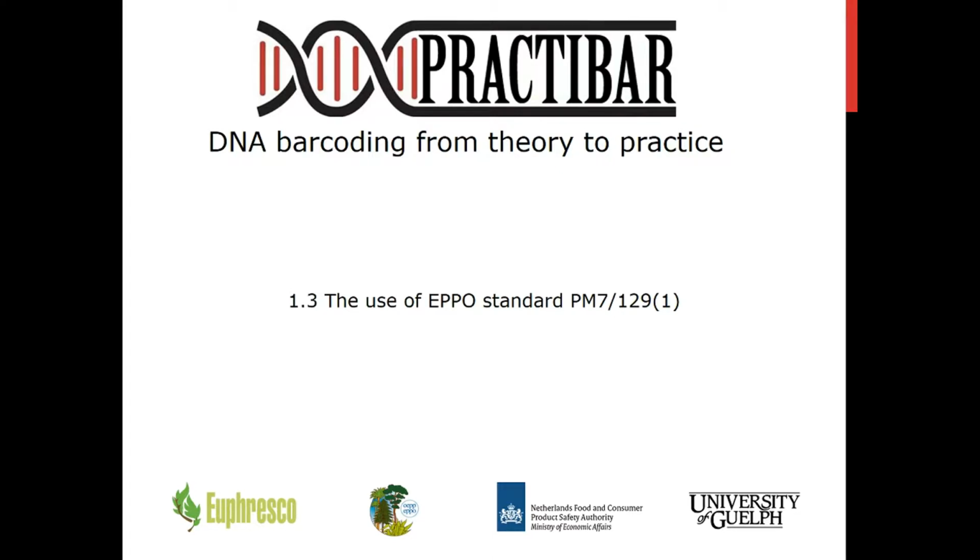My name is Bart van der Vossenberg, and this is presentation 1.3, the use of EPPO standard PM7 129 version 1 of the Practibar course package. During the Practibar course, background information and hands-on training is provided for the use of DNA barcoding in the framework of plant health.